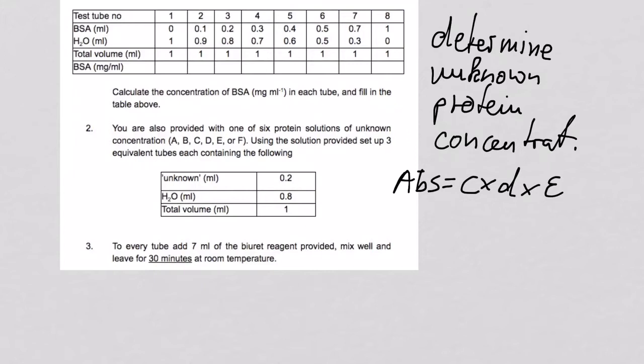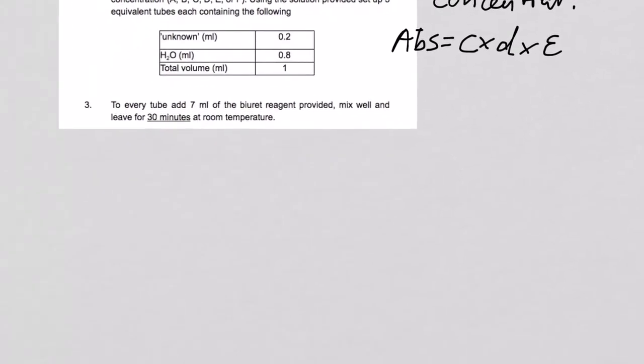So what we do with a standard curve, just as a revision, is we simply measure the absorbance for well-known concentrations of protein.